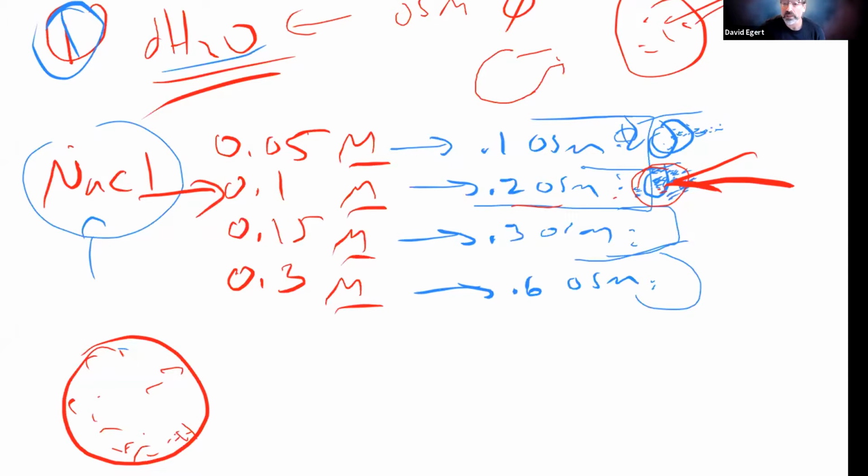At some point, we shifted to where the instructors would give blood for the class, and then we found this particular solution typically did not explode the cells.